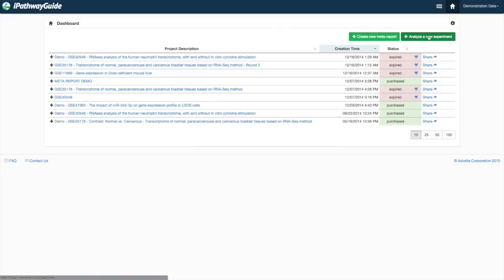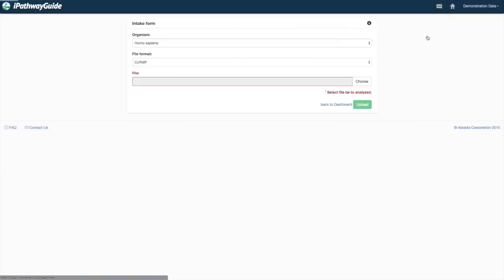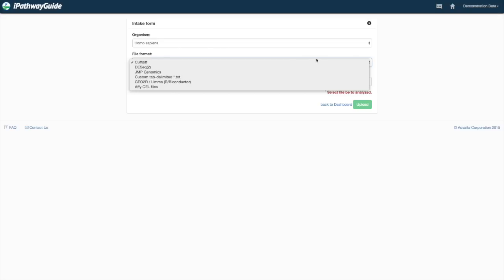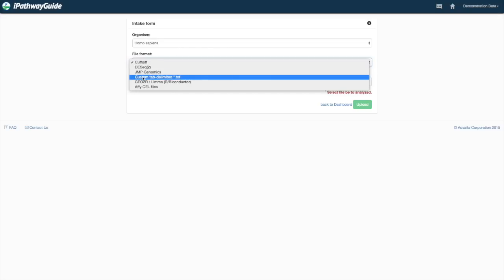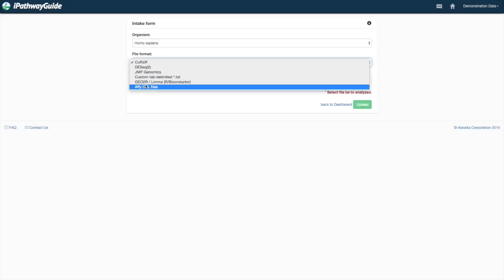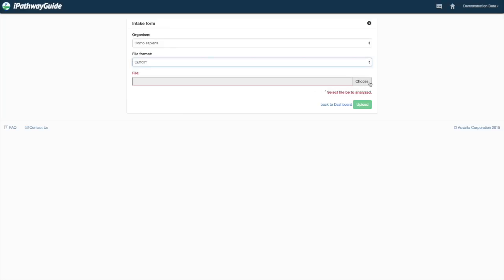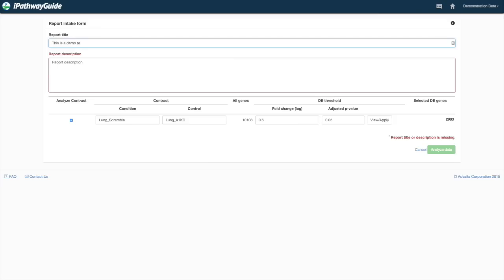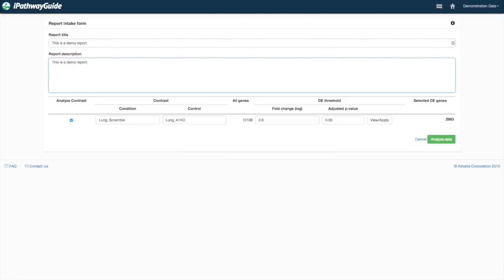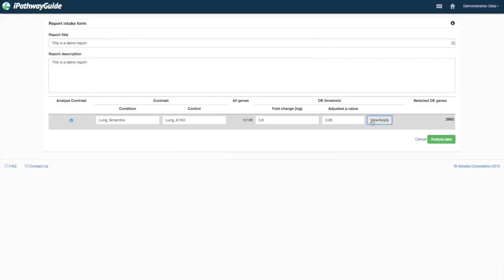iPathwayGuide takes gene expression data from microarrays and RNA-seq experiments, including output directly from Affymetrix CEL files, Jump Genomics, CuffDiff or DESeq, LEMA or G2R. iPathwayGuide also features a custom tab-delimited file importer.